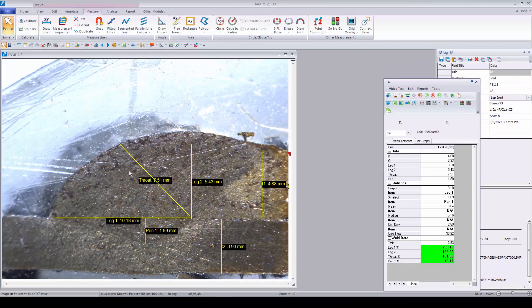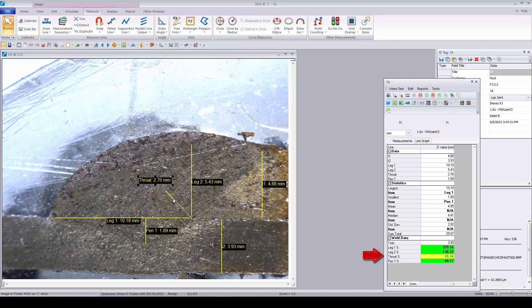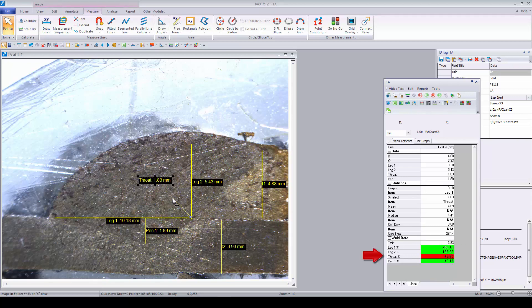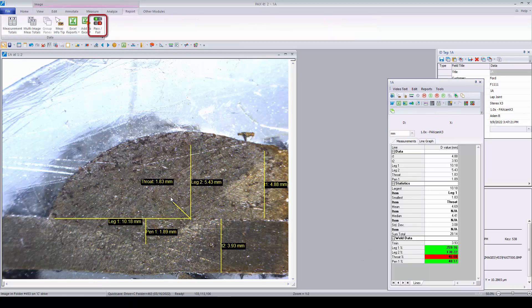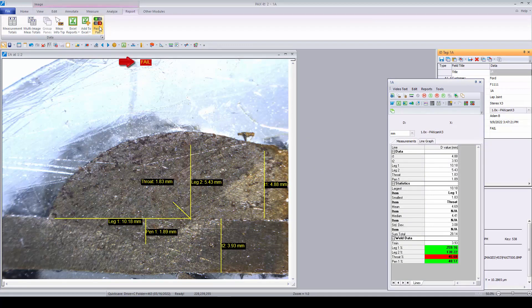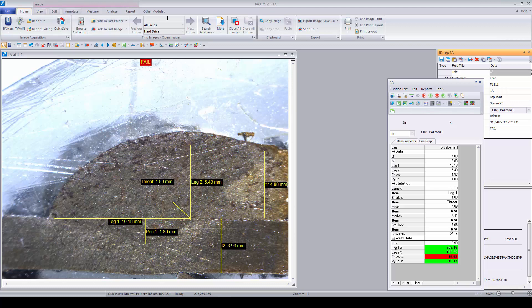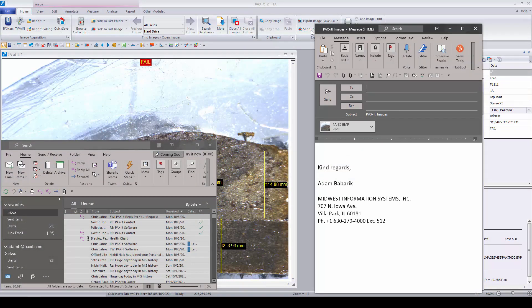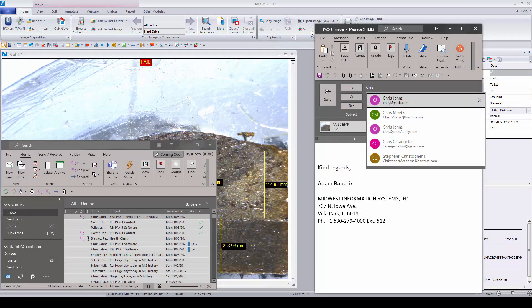The cells highlight green, red, or yellow to visually indicate the range in which they fall. Clicking the pass-fail button puts a simple label on the image and also populates the database field with the result for easy search and retrieval later on. Links to email or network locations ensure quick communication between team members for the fastest resolution to urgent matters.